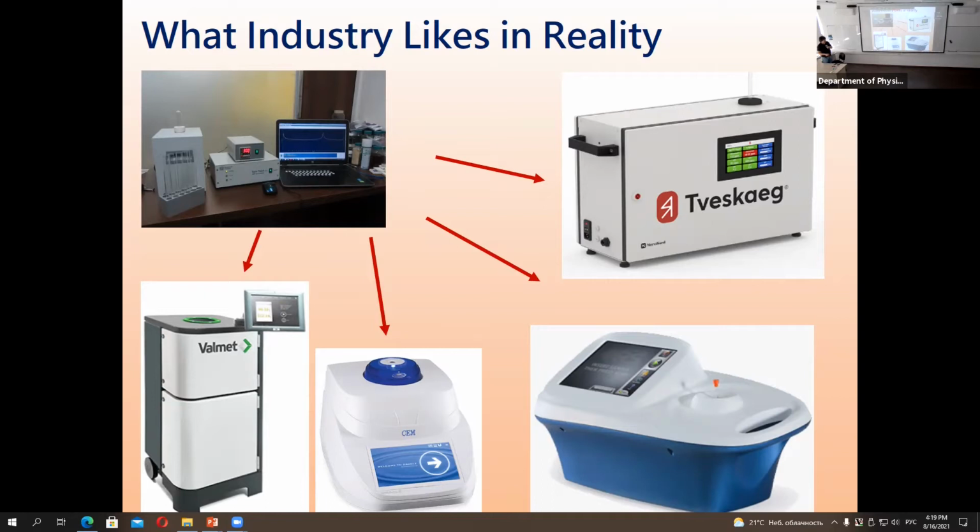They are all NMR. This one is done by my friend from Argentina, Pablo Prado, who now lives in San Diego in America. And they are producing devices to do the customs clearance of goods. You know, when you build a kind of NQR device, it is sensitive to nitrogen, and you can detect both explosives or drugs, strong drugs. So really interesting device. And this one is specially done for analysis of fat.